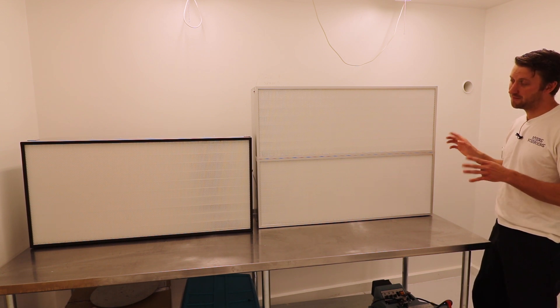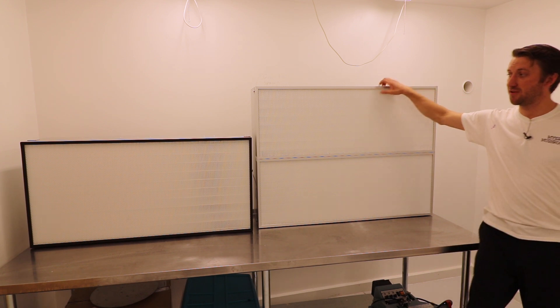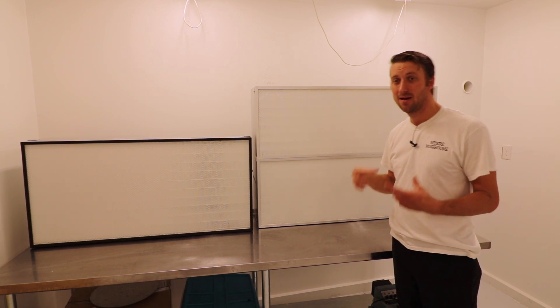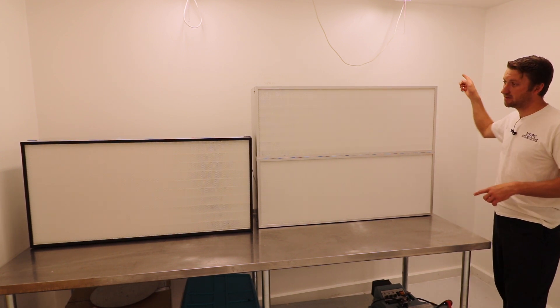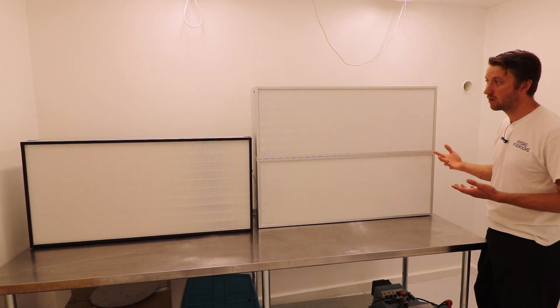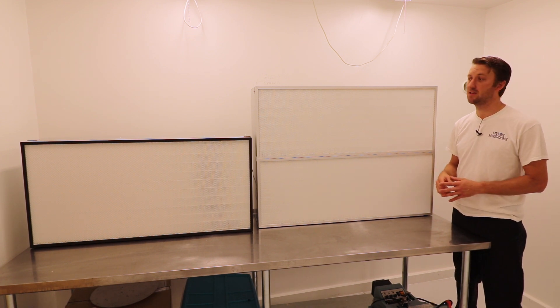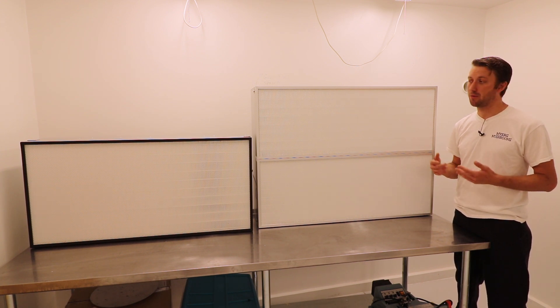Besides the complete fan filter unit assemblies, I'm also selling just the pre-filters or just the primary filters. I also have some 10x10 primary filters that I'm ordering for positive pressure units — if you want to make one, or if you have lab products rodent cage blowers like I have. I ordered a bunch of those 10x10s, which are nice for around 100 CFM to filter small amounts of air for keeping positive pressure and scrubbing.